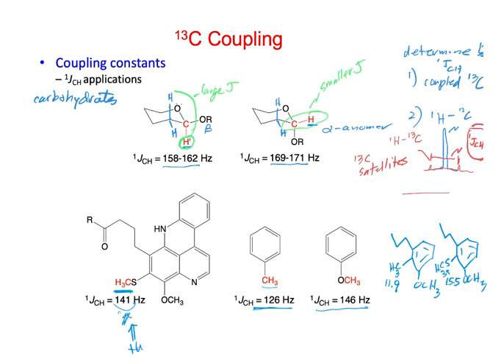So this rather than this. So you have information about coupling, chemical shift and coupling constant. And these kind of compounds are kind of tricky to work on because they just have a lot of quaternary carbons, right? There's no proton NMR coupling as you go around some of these substituents around the aromatic ring. So it can be challenging.